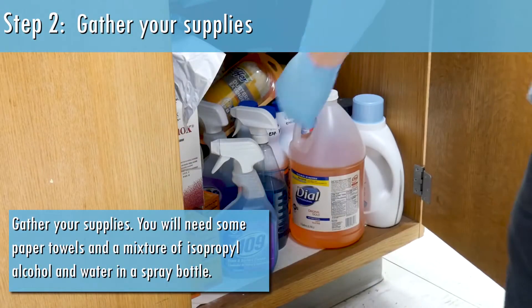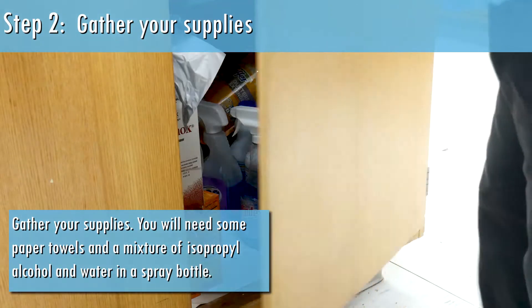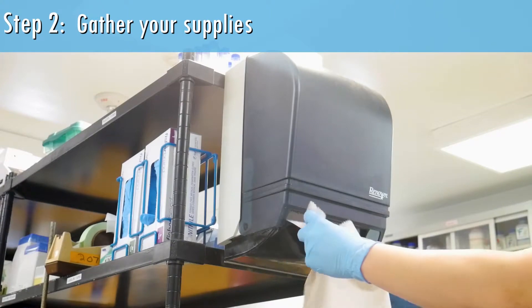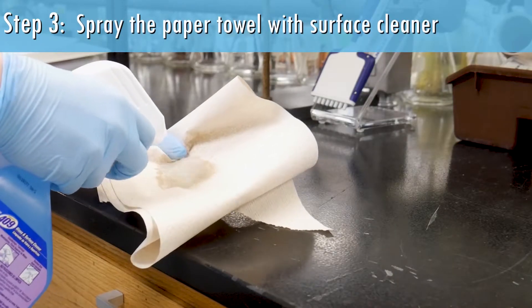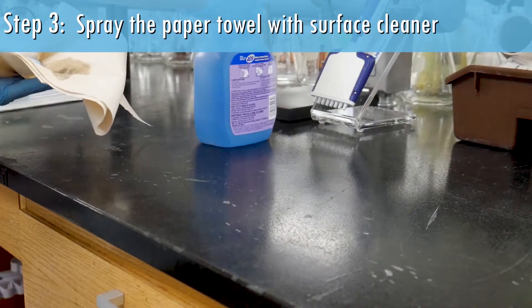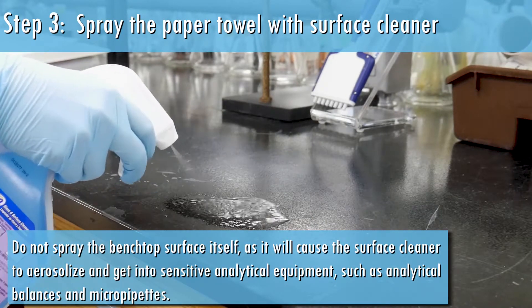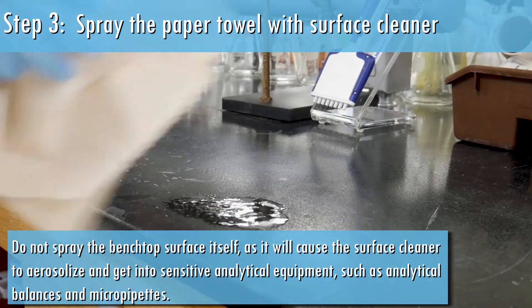Gather your supplies. You will need some paper towels and a mixture of isopropyl alcohol and water in a spray bottle. Spray the paper towel with surface cleaner. Do not spray the benchtop surface itself, as it will cause the surface cleaner to get into sensitive analytical equipment.